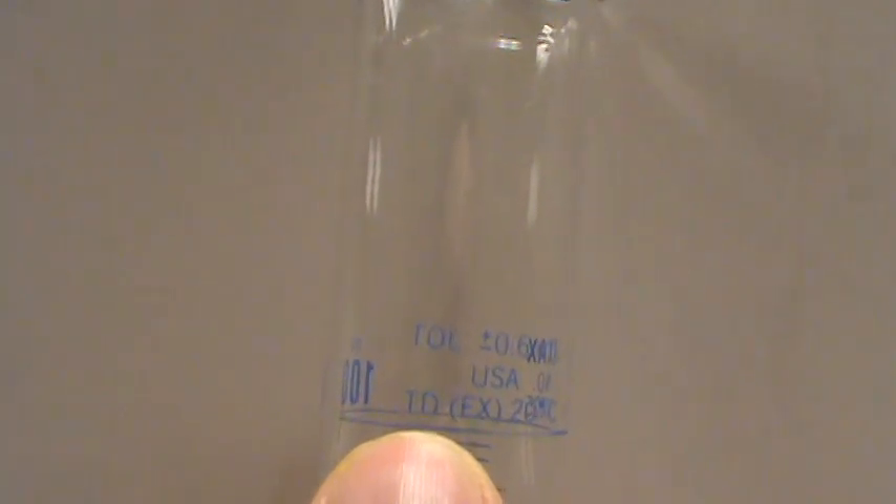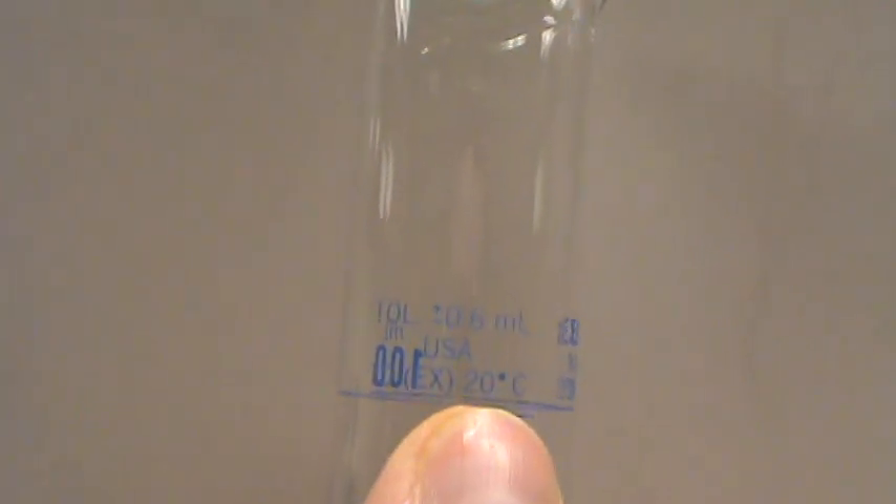The other thing to notice on here is this next line that says TD EX 20 degrees Celsius. What does that mean? That TD is going to become more important later and it's going to come up a few times. TD means 'to deliver.' This piece of glassware is calibrated to deliver the measured amount of liquid at 20 degrees Celsius.